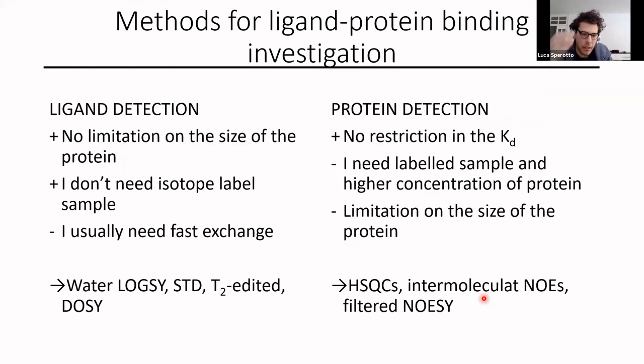So with this, I finish a quick overview on different NMR spectra that we checked. We saw different NMR spectra that are usually used to study our proteins, so for the dynamics of a protein, the interaction, the structure calculation, and so on.